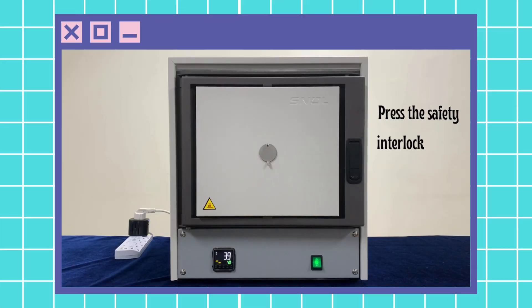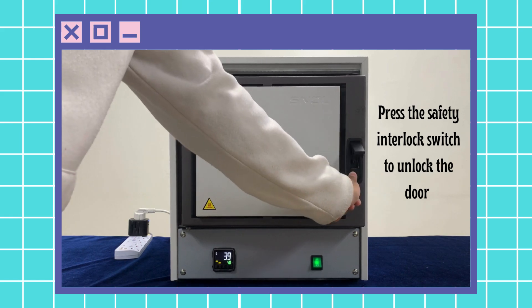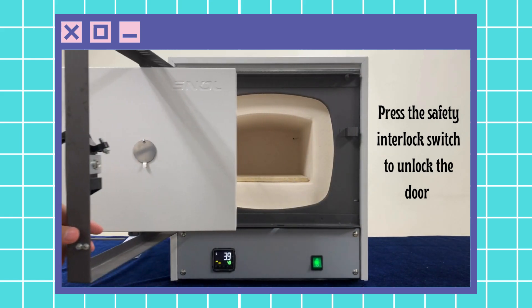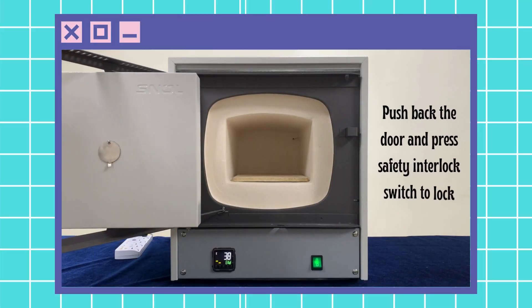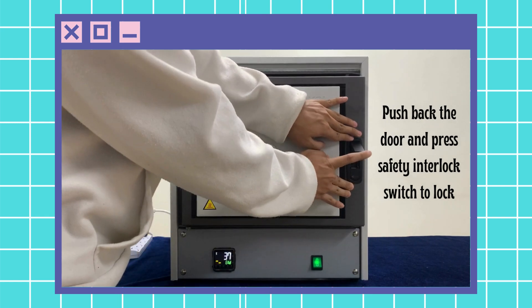To open the furnace, press the safety interlock switch at the right side of the furnace. To close the furnace, push back the door and press the safety interlock switch.